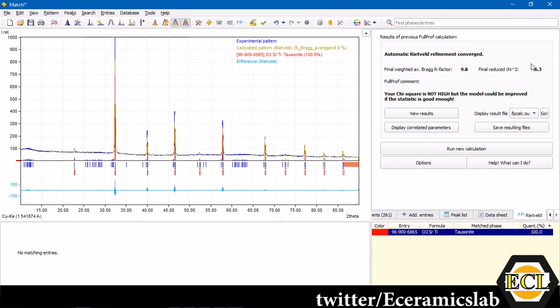Here we have found that chi-square is 6.3. Any value below 10 is good and below 5 is much better. So 6.3 is respectable and 9.8 is good value. We have done the automatic Rietveld refinement in our case.